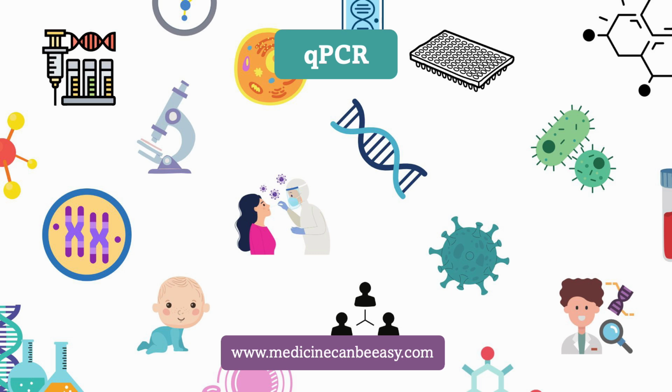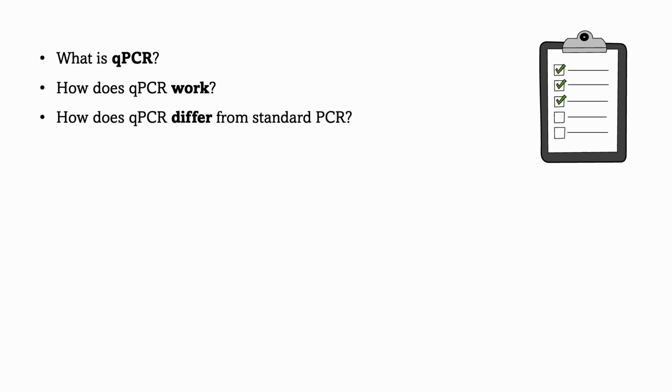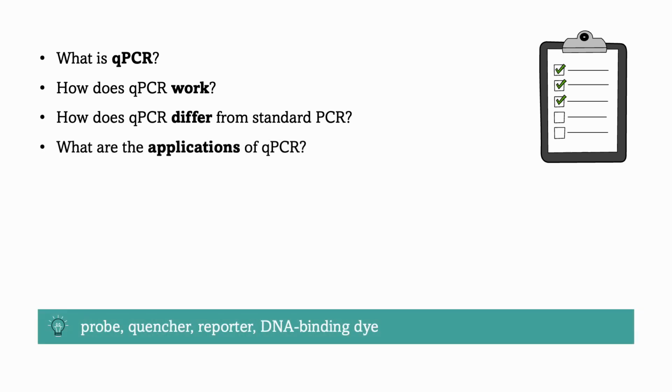So what are you going to learn in this video? I am going to explain what quantitative or real-time PCR is and how it works. We are also going to compare standard PCR and qPCR and discuss the applications of the method.